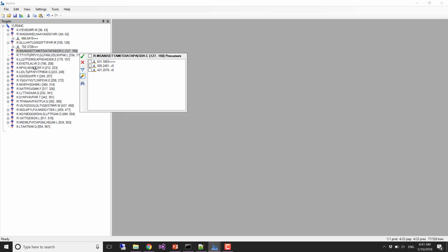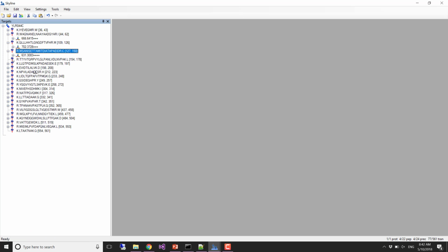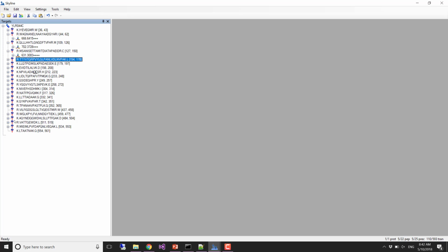So if we really wanted to try to measure this thing, we could say, let's check, okay, we're going to do the charge 4 one. And we could individually go down here and add charge 4s for the ones that could only be measured with charge 4.